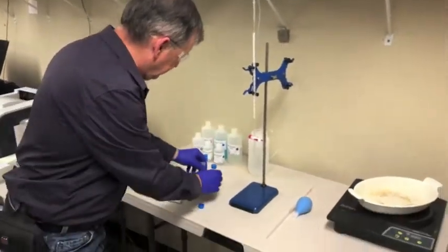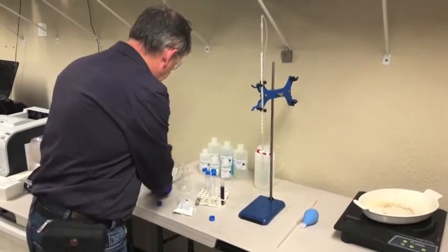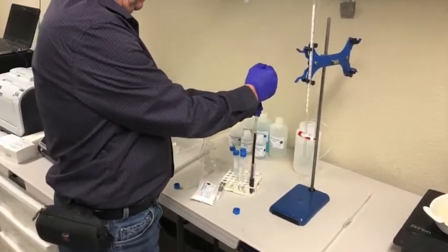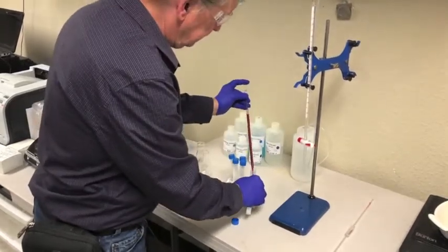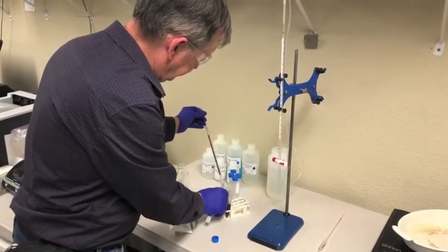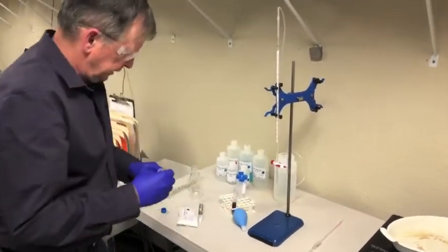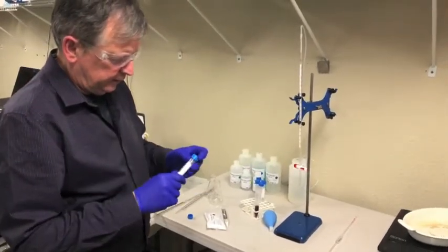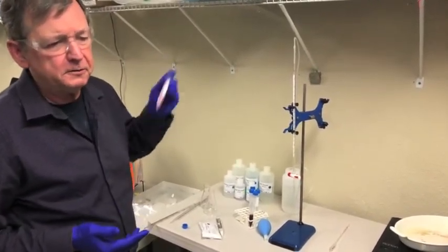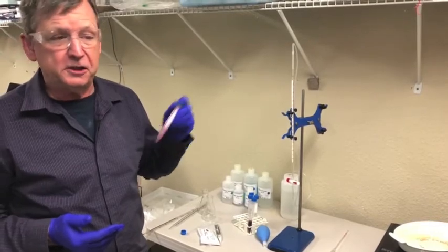I'm going to take five milliliters of a wine sample and place it in the vial filled with the powder. There's five milliliters — I'll put that in there, put the cap on the tube, and shake it. We say five minutes, although honestly two or three minutes of steady shaking is enough. Then the next step is to let it settle, centrifuge it, or filter it.